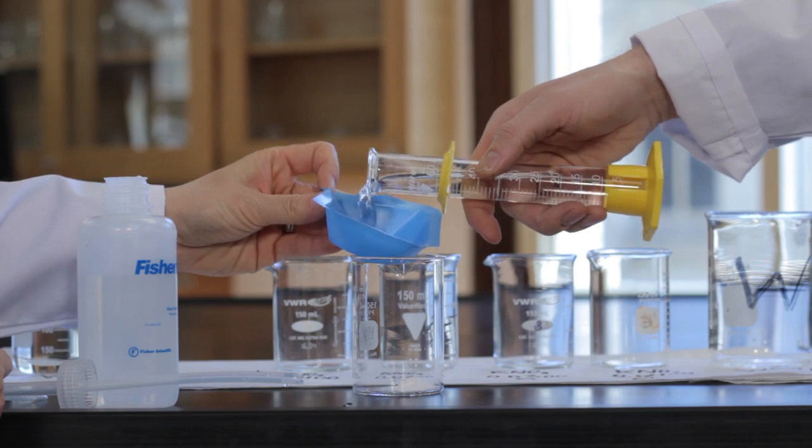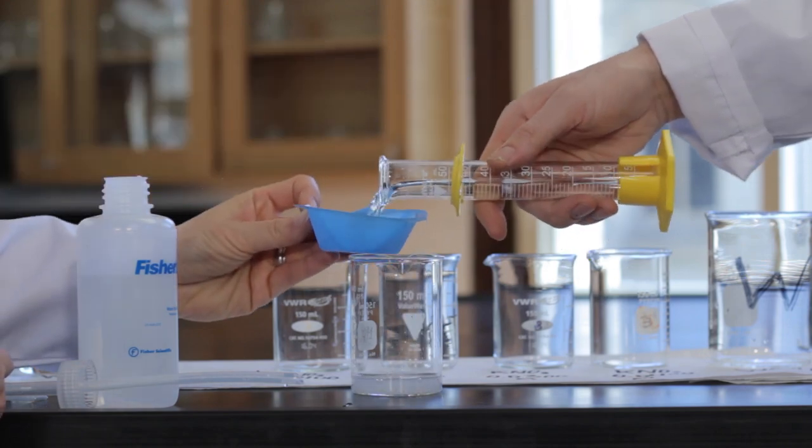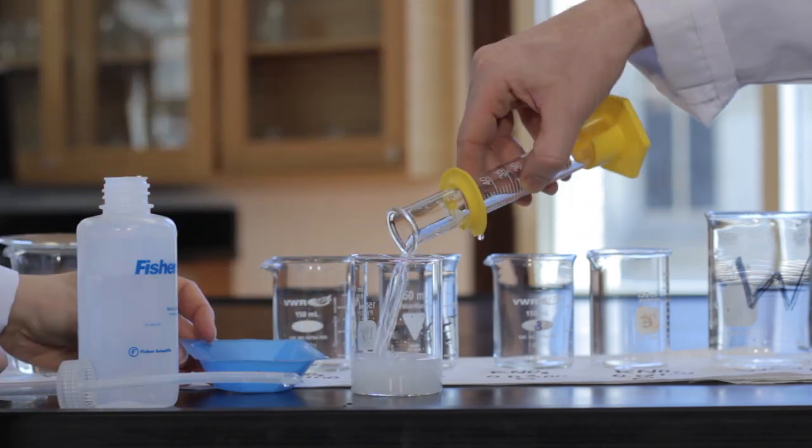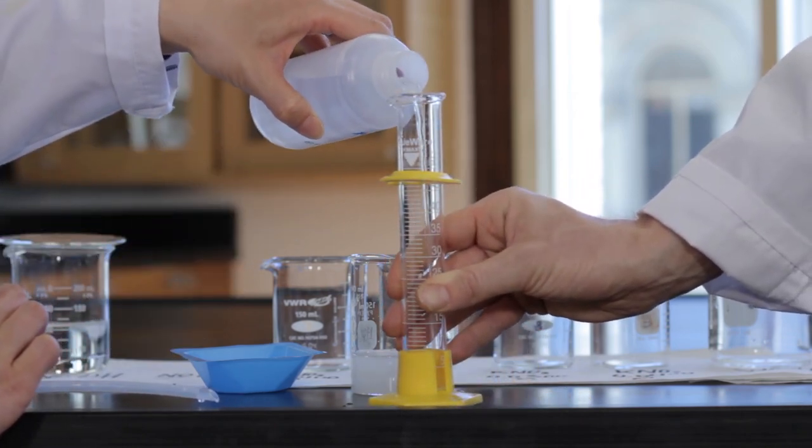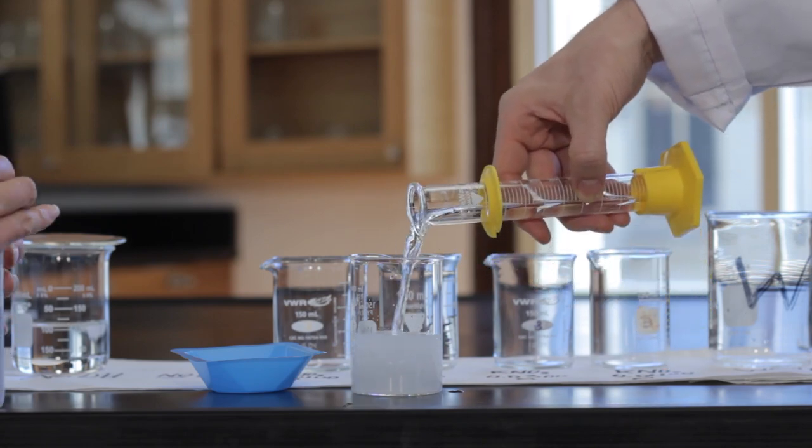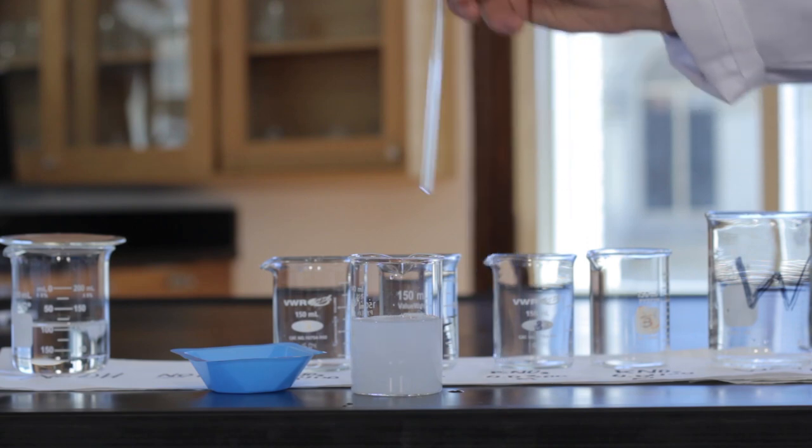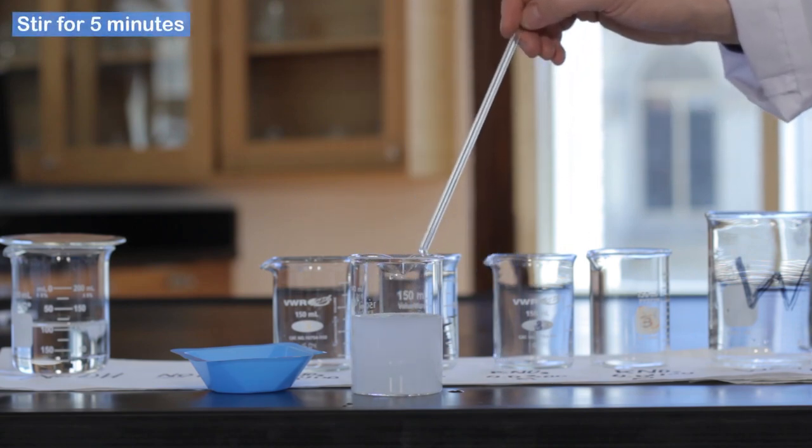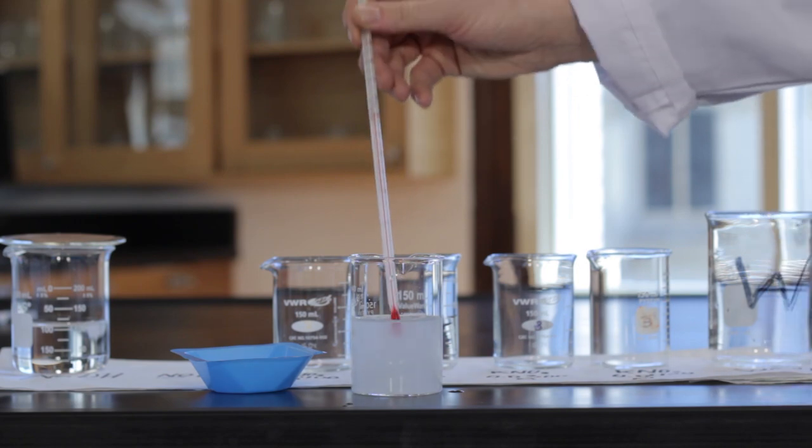Add approximately 100 milliliters of distilled water to the beaker and stir the solution vigorously for 5 minutes with a glass stirring rod. Record the temperature of the solution.